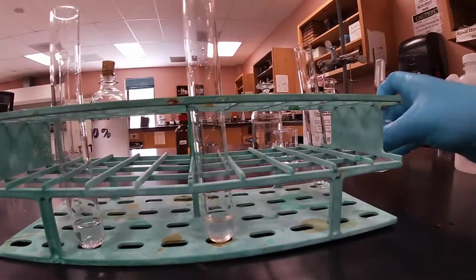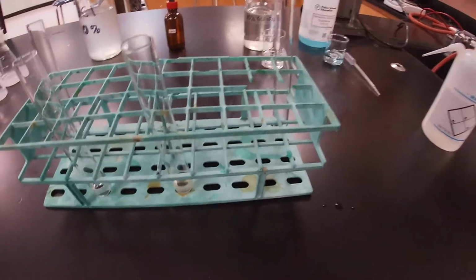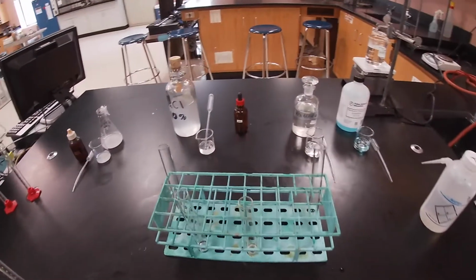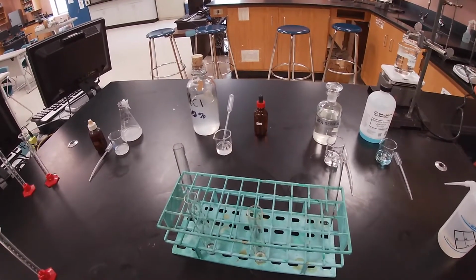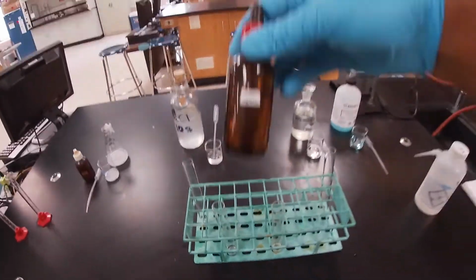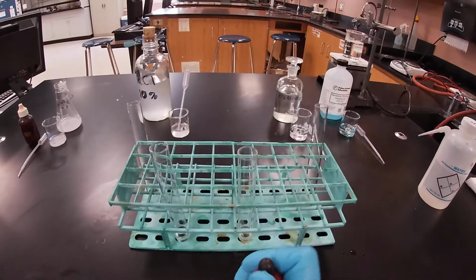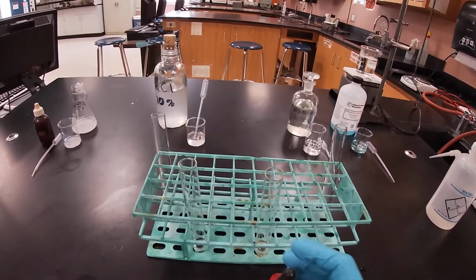And so now what we're going to do for our test, in order for us to test for the chloride ion, is add 2 drops of the silver nitrate, and we're going to stir, and we're going to determine what we observe, right? So we're going to get our silver nitrate solution, right? We're going to add 2 drops. And of course, normally you would use 2 hands for this.